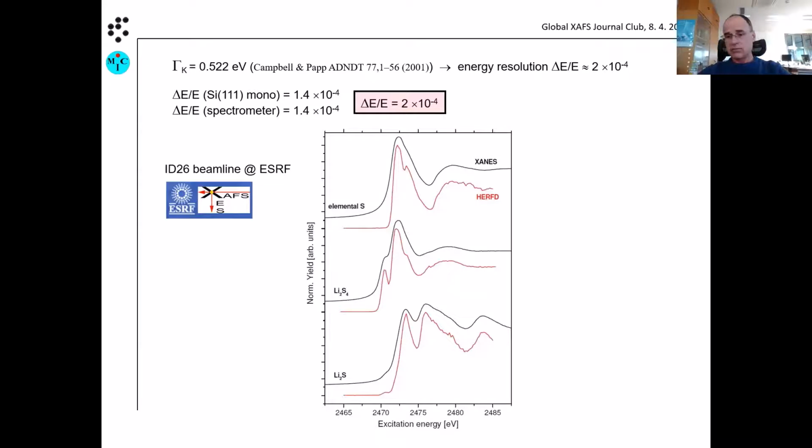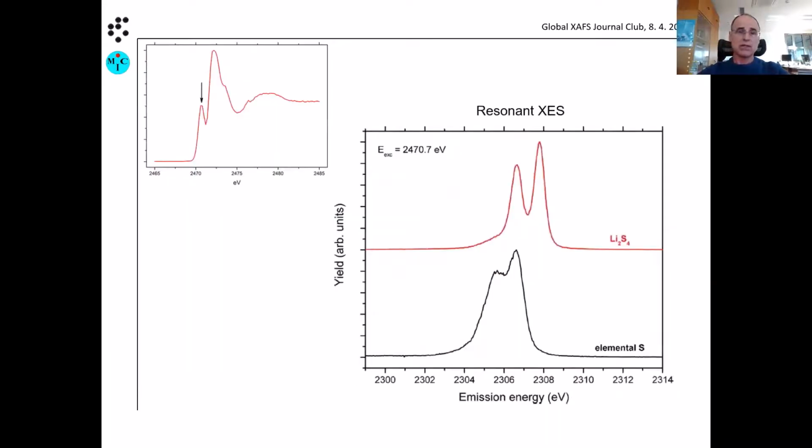After that, this work was started. Let's do it on a battery. Ultimately, one wants to do it in operando mode, with a battery closed in an in-situ cell, which can be inserted in the vacuum atmosphere of our spectrometer. But as you have seen, we always need to collect these RIXS planes, and generally this is a bit time consuming. One would like to avoid that, because in a battery it's a delicate process.